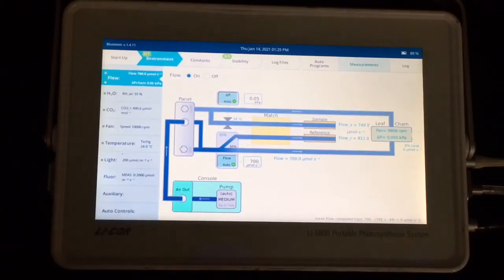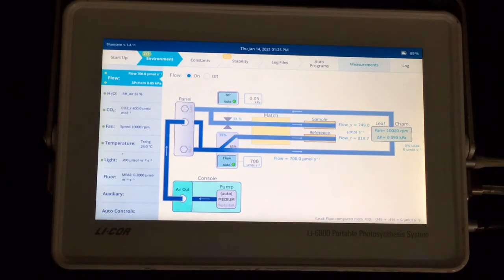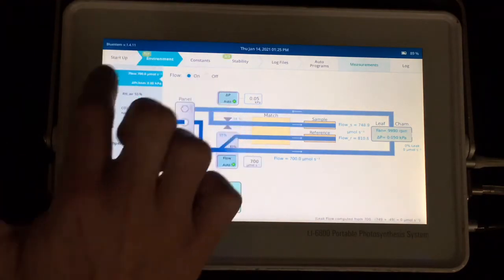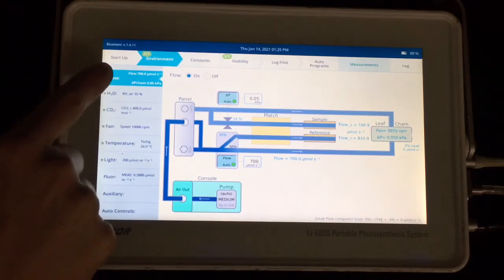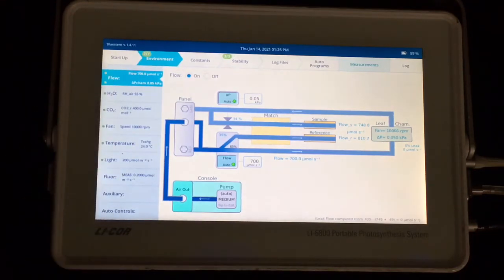Okay, so we're going to walk through some typical environmental control setups to make a basic survey measurement. And you can see in the environment tab, all the environmental controls are sub tabs within that tab. And we're just going to start at the top and work our way down.